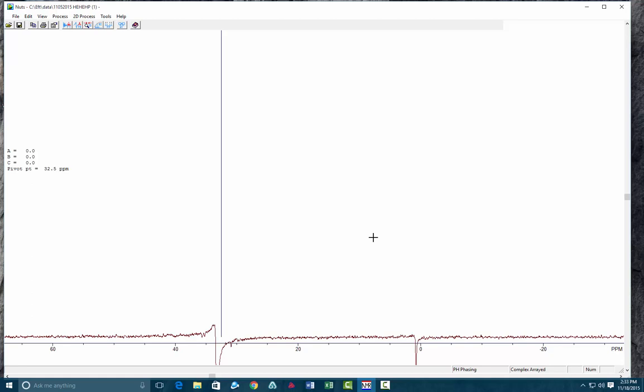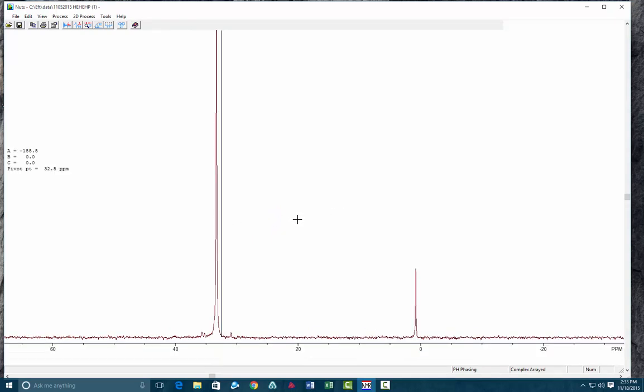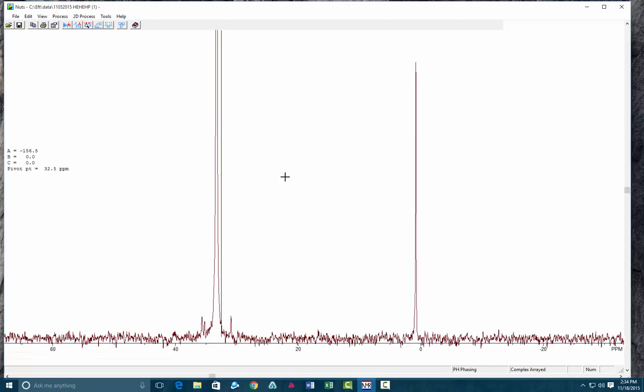So this is bringing my computer to its knees, which is strange because it's a pretty fast computer. I don't have a good video card though. So I'm going to phase this. Your phasing values for the frequency independent should always be less than plus or minus 180, and it was pointing almost all down, so you see it's minus 156. I'm going to blow it up a little bit more so we can see if we're really phasing it correctly. And there's the phase, and it has to put that on all of them. Wow, that is taking a long time.